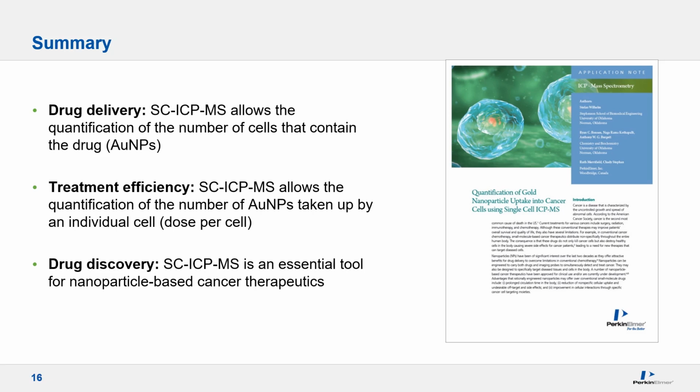And it also will therefore play an important role in drug discovery, as the single cell ICP-MS technique is then an essential tool for nanoparticle-based cancer therapeutics. This work is again taken just as a very short summary from the much more extensive upload, which is shown here on the right, again downloadable from our website.